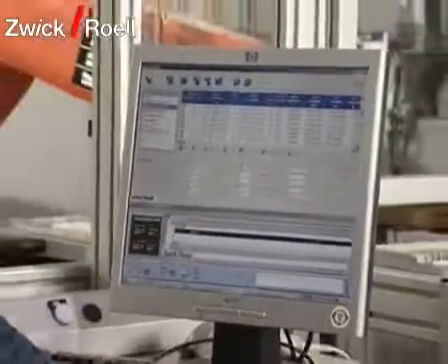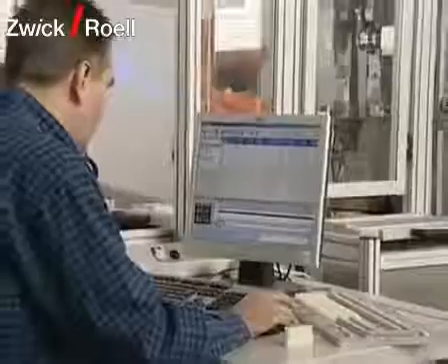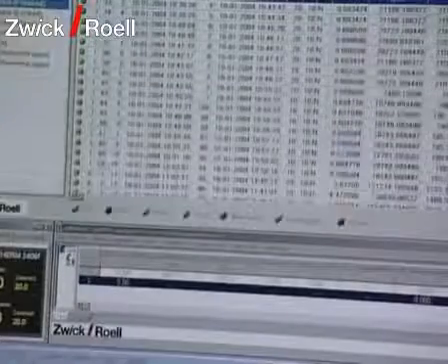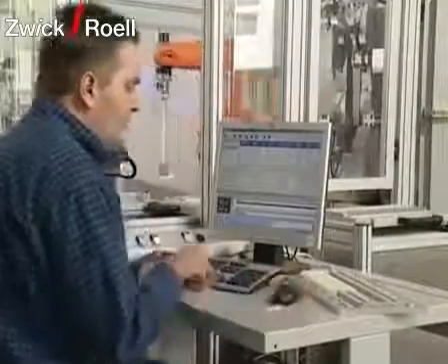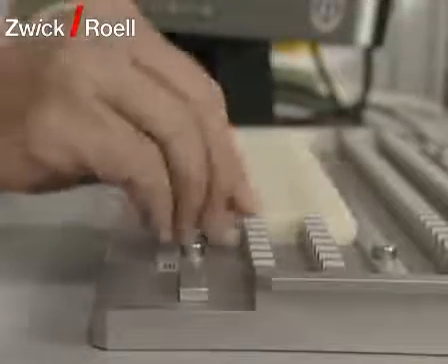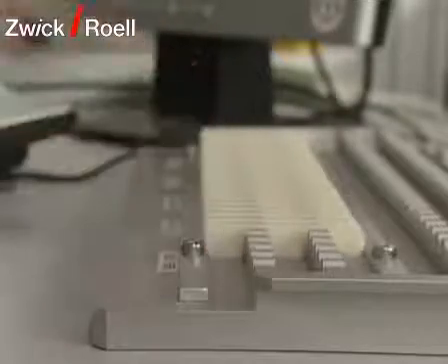The Test Expert testing program is used for the control of the testing machine. First, the operator saves the specimen data relevant for testing in a database, such as testing temperature and type of testing. Then, the specimens are sorted into the specimen carriers. The testing sequence is determined by the built-in pendulum and the required temperature in the temperature chamber.